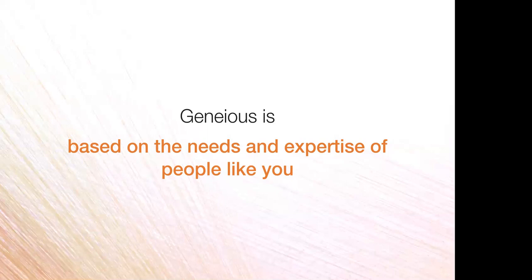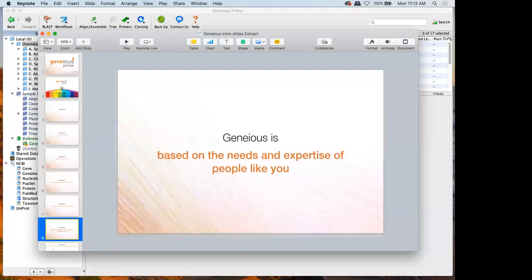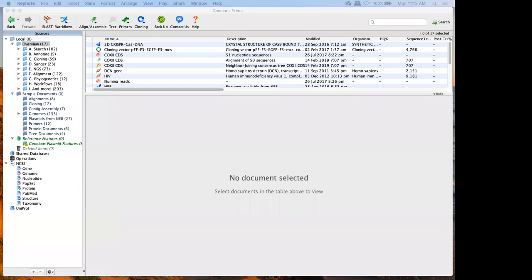So I think that's enough of slides. Let's get out of there. Like I said, the rest of this is going to be a live demo. If you do have Geneious installed, you're welcome to open it up and look at where I'm clicking, but that's definitely not needed. And as I said, this is being recorded, so you can refer to the recording later.